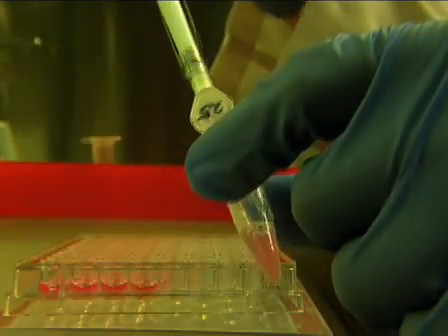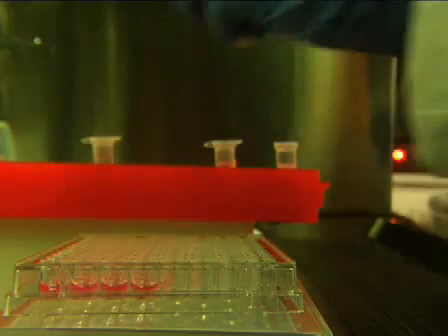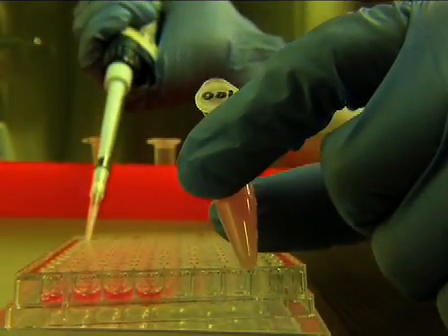For certain experiments, it might be necessary to uncouple phagocytosis from lipid synthesis. For example, to study the effects of certain drugs on lipid synthesis without affecting particle engulfment.